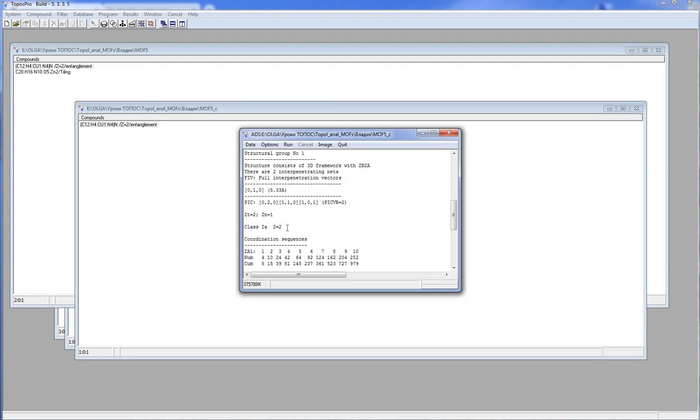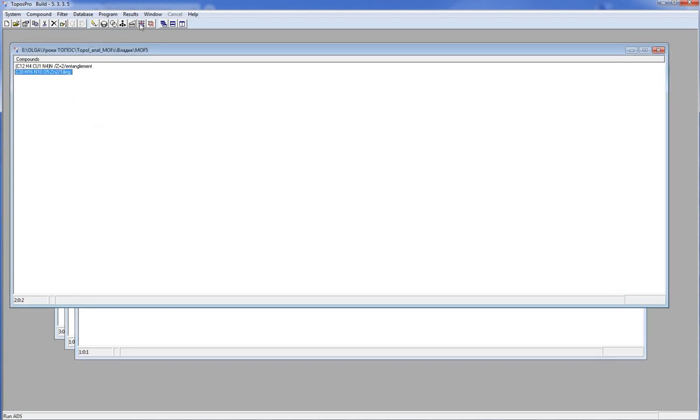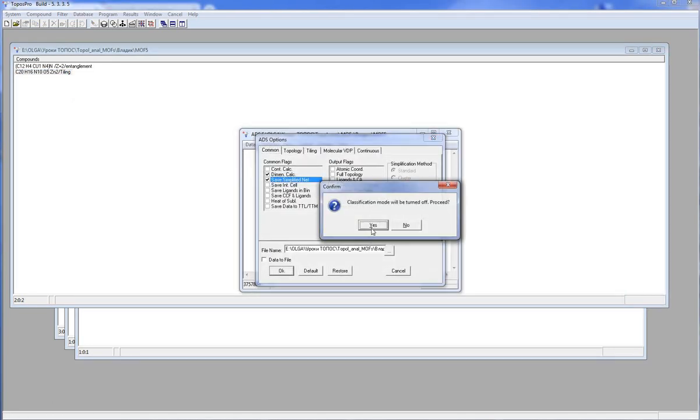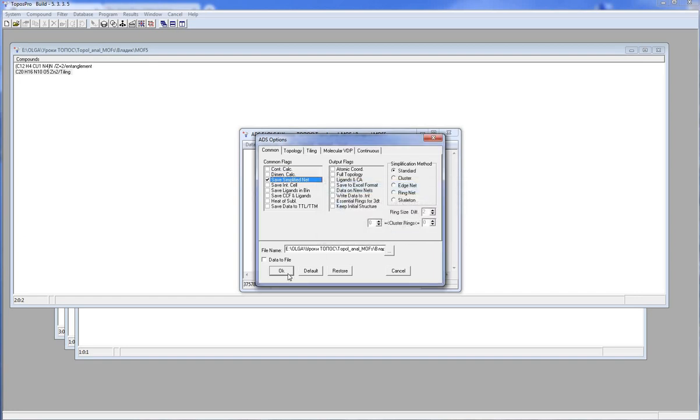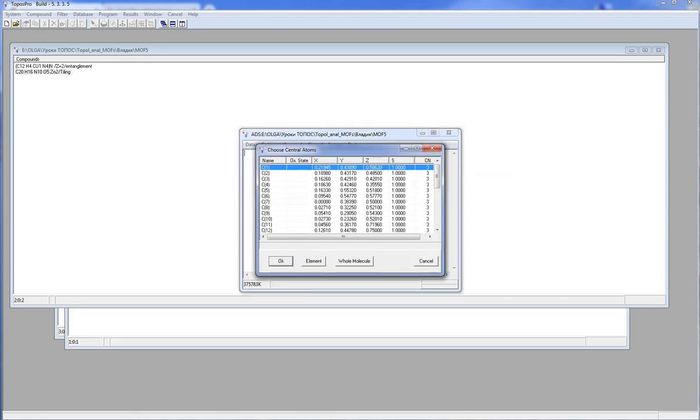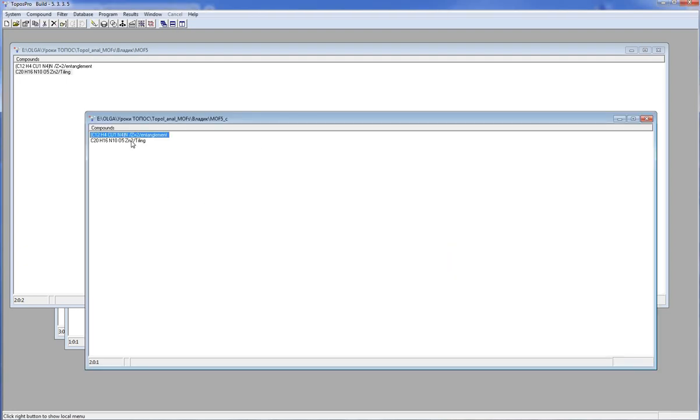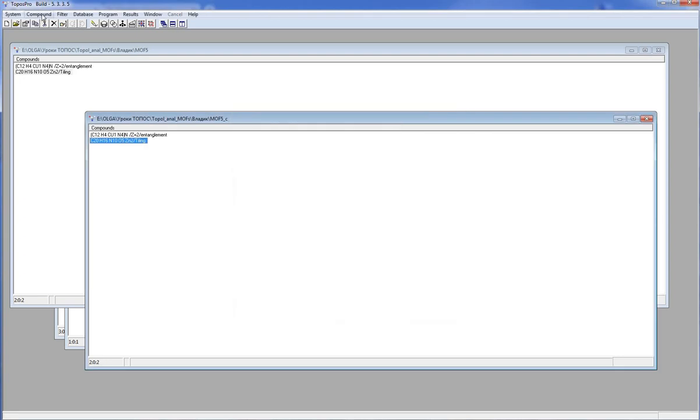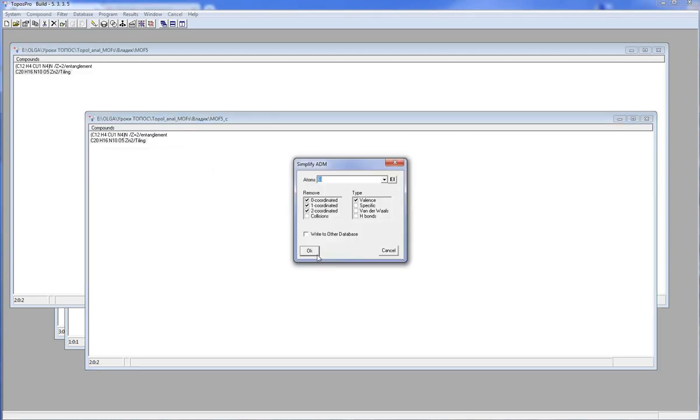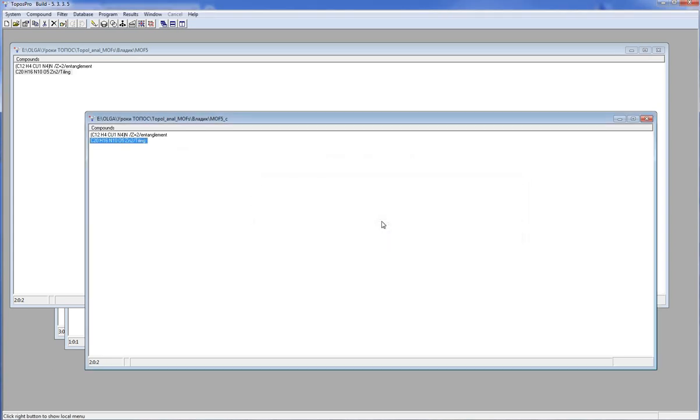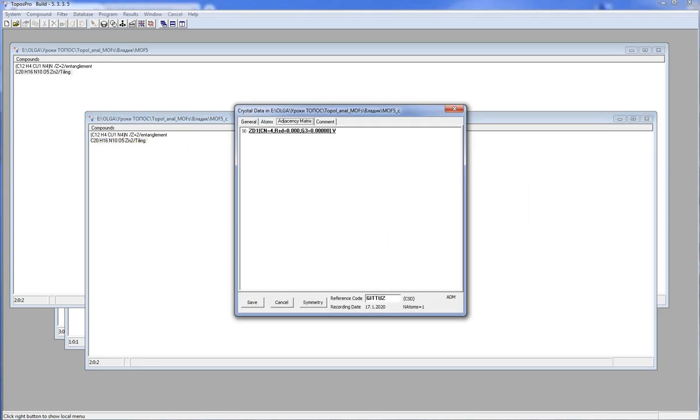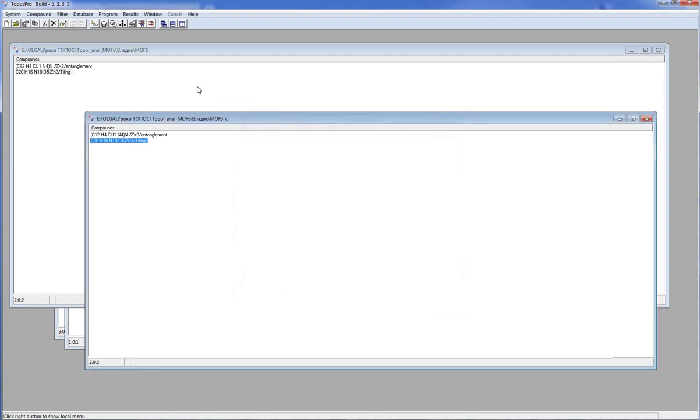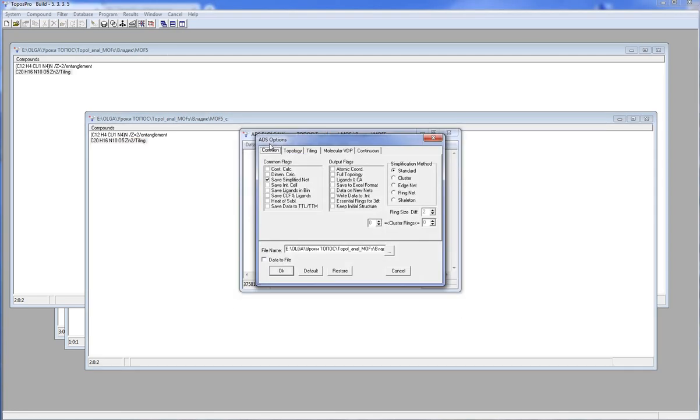You can find more information about interpenetration in our video lesson Entanglements. You can construct the tiling for MOFs to analyze the pores in the structure. For this purpose, you should construct the underlying net and delete 0, 1 and 2 coordinated nodes. Now you can construct the tiling with the ADS program.